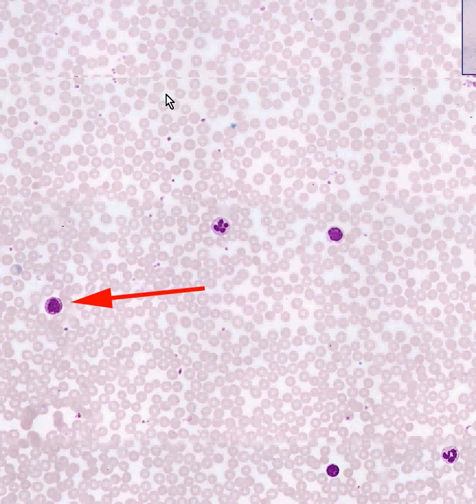The overwhelming most common type of cell are the small, round red cells with slightly lighter cytoplasm centrally. They do not have nuclei. These are red blood cells. There's about 5 million of these per cubic millimeter of your blood. The white cells are only about 1,000th as common. They're only about 5 to, let's say, 10,000 per cubic millimeter. And there are 5 different kinds of white cells.